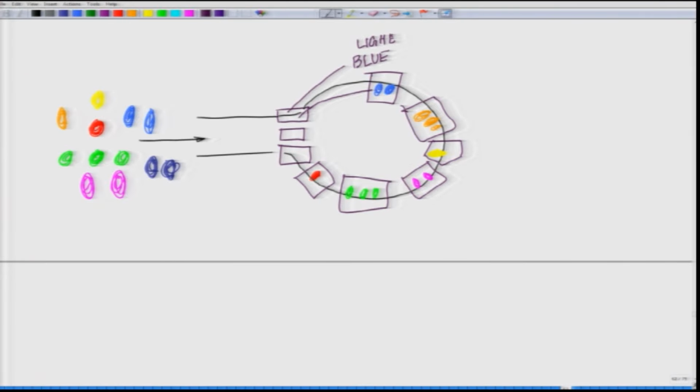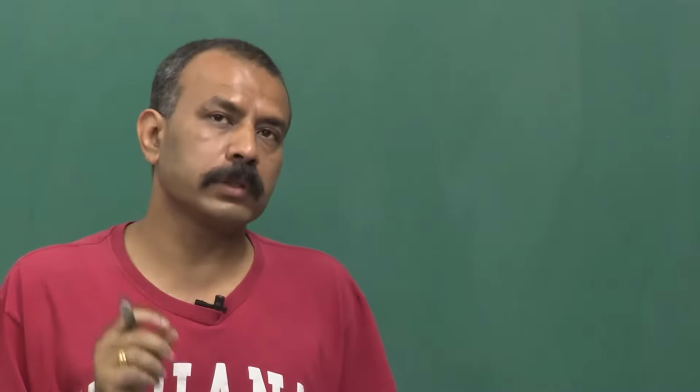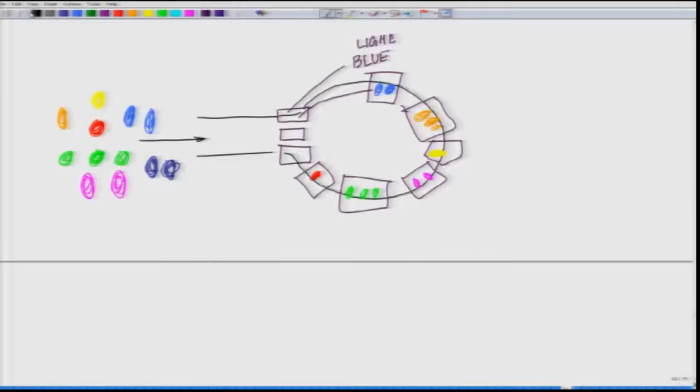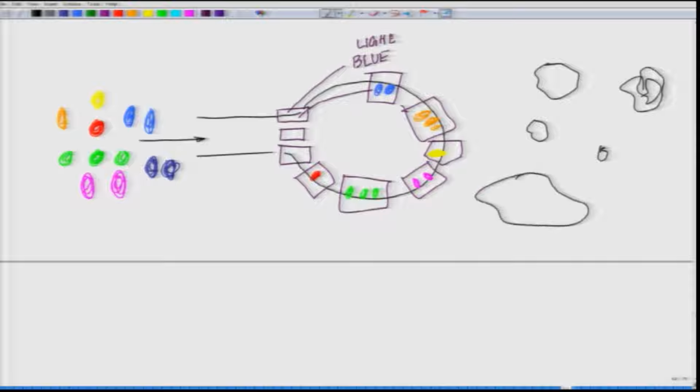So, there are locations which are reserved. But location is not the issue. The issue is how you separate them out. That is the most critical point. In order to separate them out, the first thing one has to do, if you get these specific cell types, say I get this, this, this, this, this. So, there are 5 cell types. Say I am getting A, B, C, D, E.